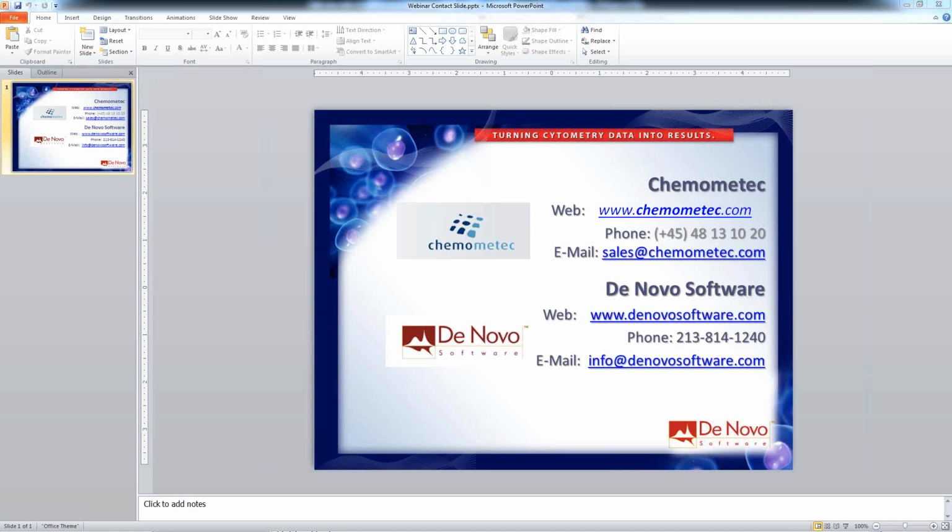However, one of the big issues with some planktons, at least, but all plant cells, is that there is this cell wall that tends to be a border for different dye processes. But you're very welcome to contact us either at the email address or directly go to the web page and then request a trial, and I'll be happy to work on this specific case.